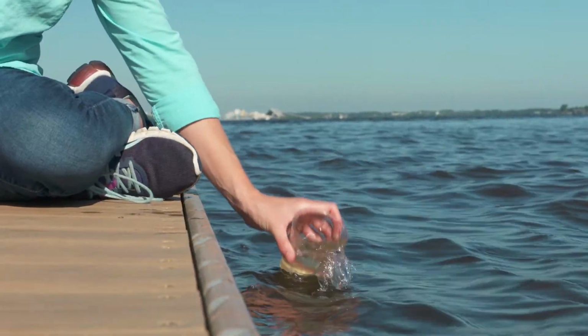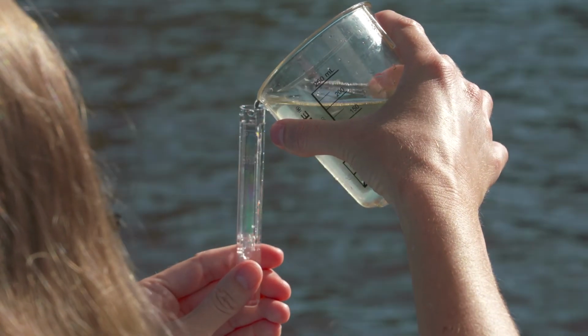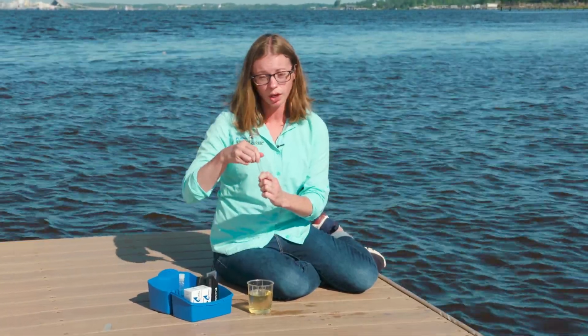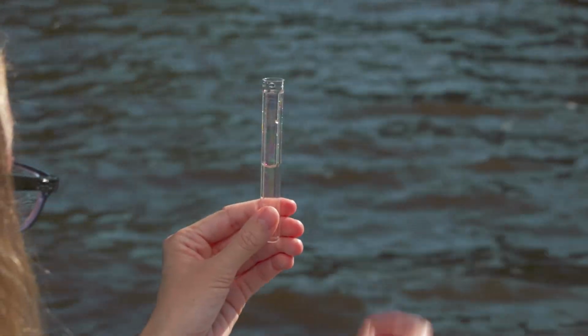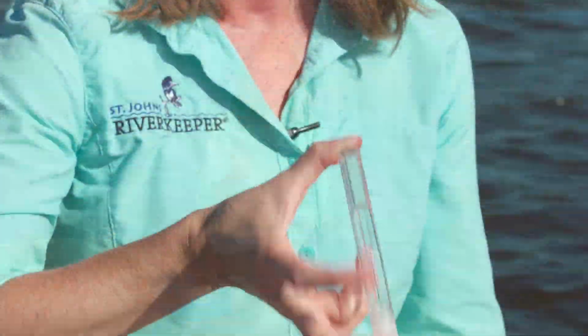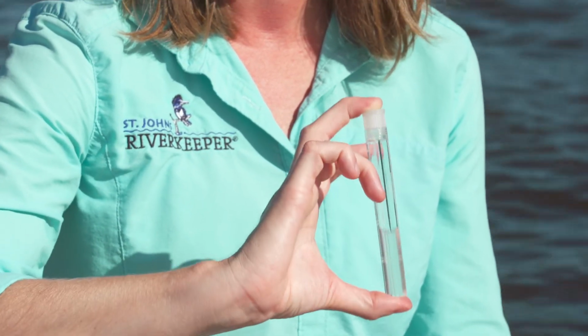First thing we're going to do is collect our water sample. Then we're going to add 5 milliliters of the water into a little vial. I'm going to add 1 tablet, cap it, and invert until the tablet dissolves. And depending on the temperature of the water, the tablet will dissolve quickly or slowly. So the tablet is now dissolved.